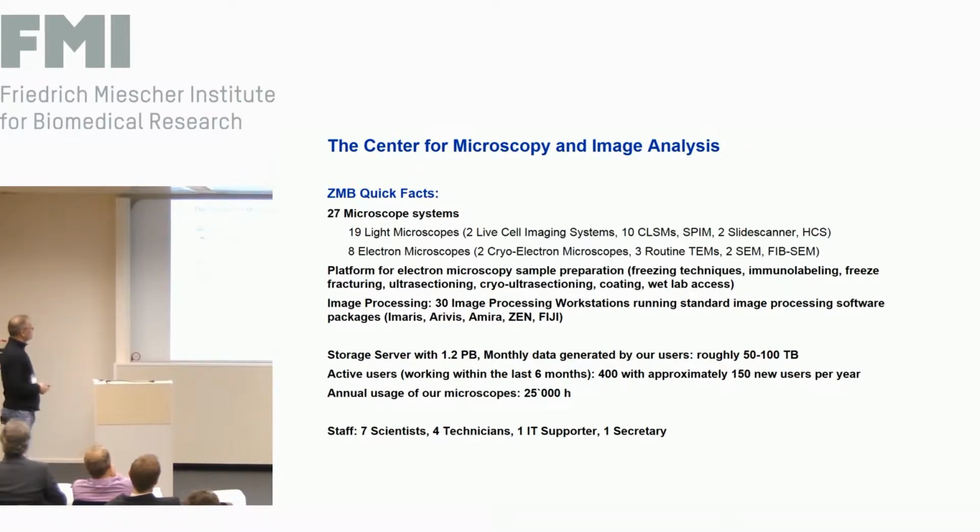Nowadays, we have 1.2 petabyte of storage service. In contrast to FMI and other research institutions, we are not responsible for storing data in the long run. So everything I tell you is short-term storage for 3 months maximum. Then users have to transfer it. And fortunately, we don't have to care how they do it. So I will not talk about that one.